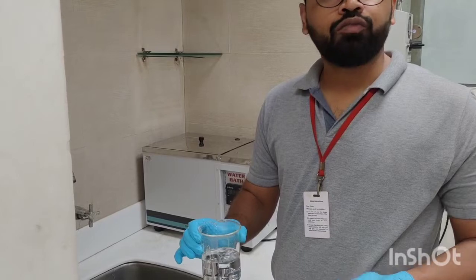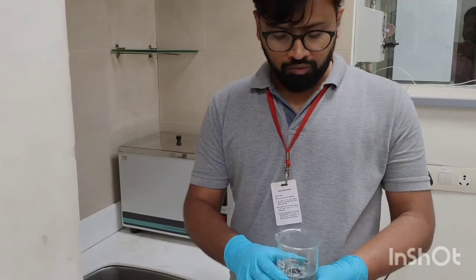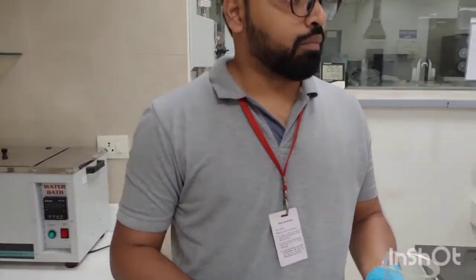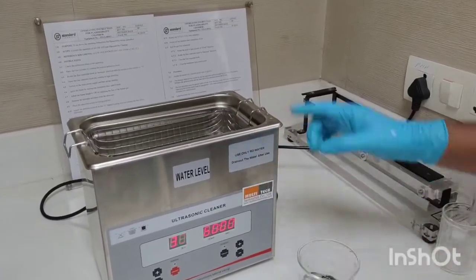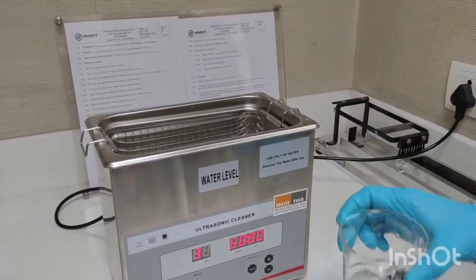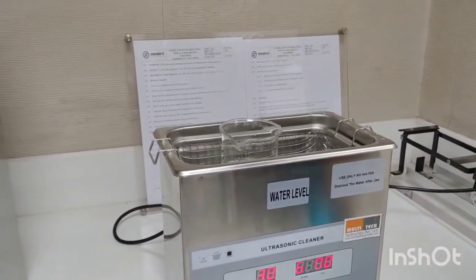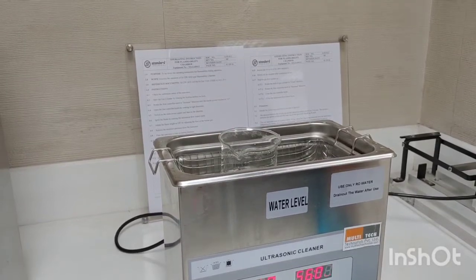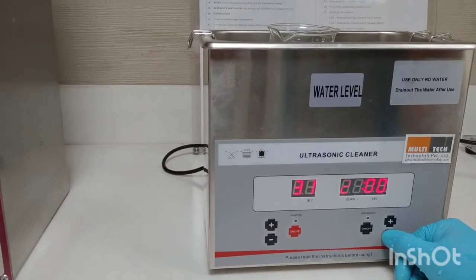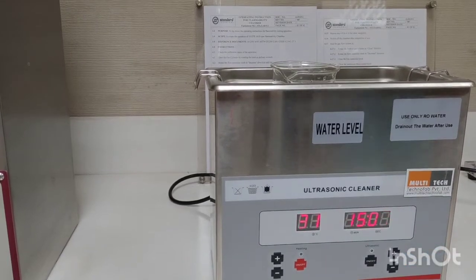The sonicator protocol is: 15 minutes in acetone, 15 minutes in hexane, and then 15 minutes in methanol — finally then we will be fixing it. We are going to move to the sonicator and sonicate with the solvents one by one. We have already cleaned the water bath and kept some water inside it. We will place all parts in the sonicator and set the time to 15 minutes.